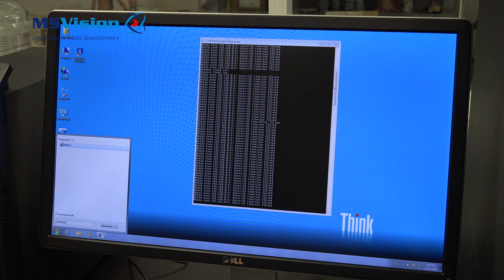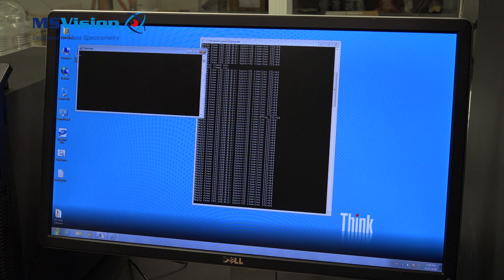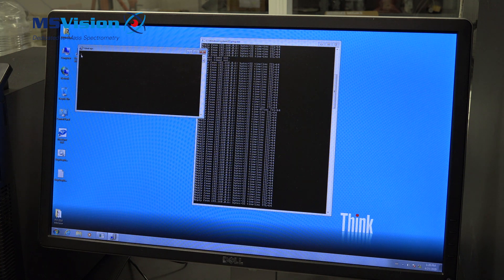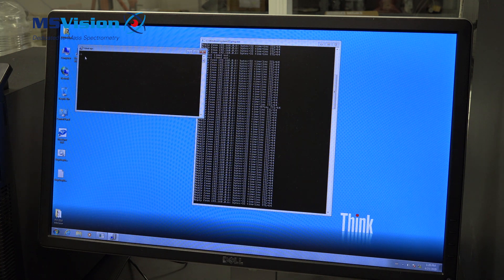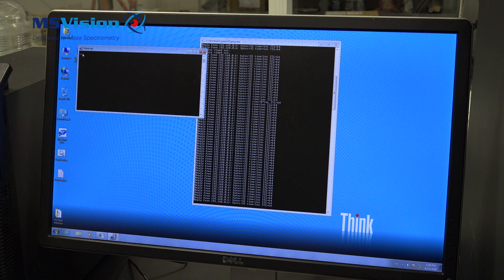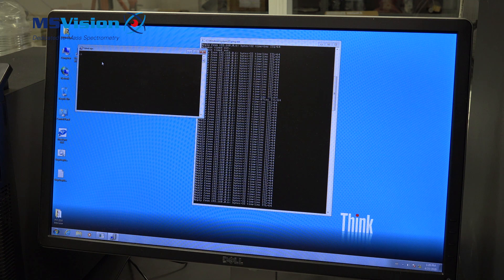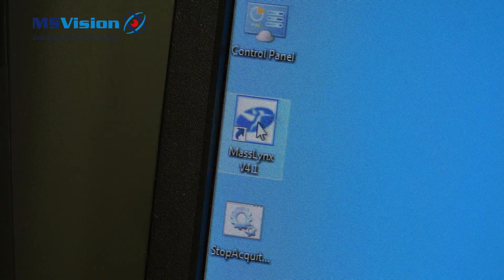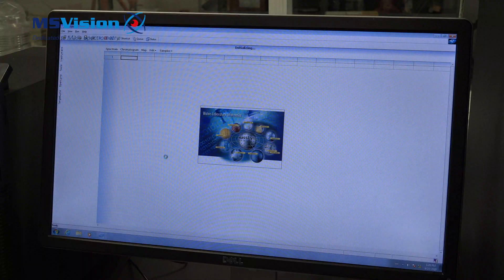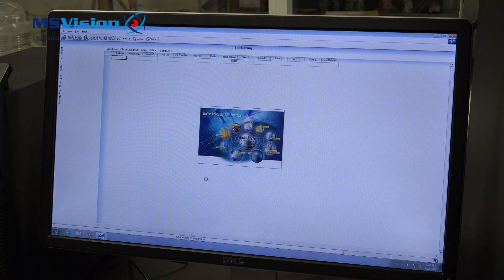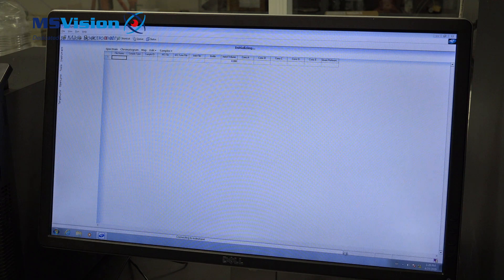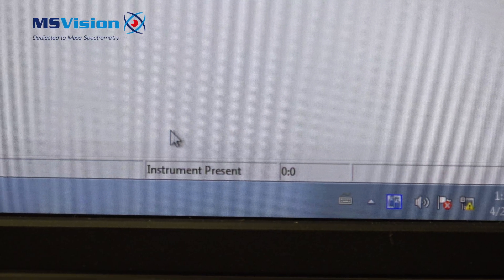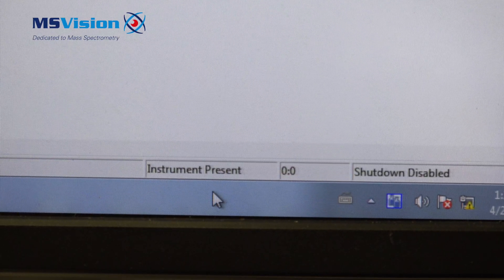And we can start Mass Link again. You can close these two windows, start Mass Link, and at the bottom here you should see that the instrument is present and not scanning.